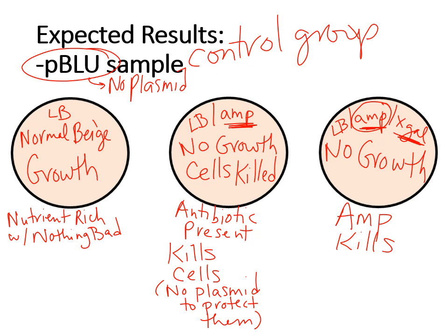Maybe the ampicillin got degraded or destroyed, because the way that we prepare these plates is that we add the ampicillin while the agar is still liquid, meaning it's hot, freshly sterilized from an autoclave, so it's really hot. If you don't let it cool enough, then it's too hot and it denatures the antibiotic. If you let it cool too much, it starts clumping like jello because it wants to solidify. So it's a tricky thing to make these plates. So sometimes there could be a problem with the ampicillin in the plate.